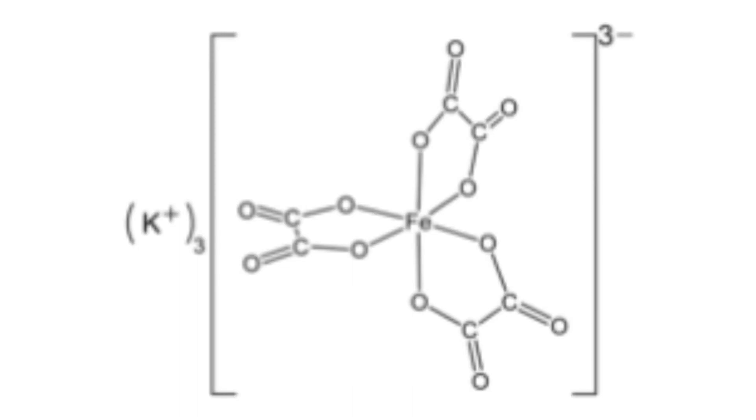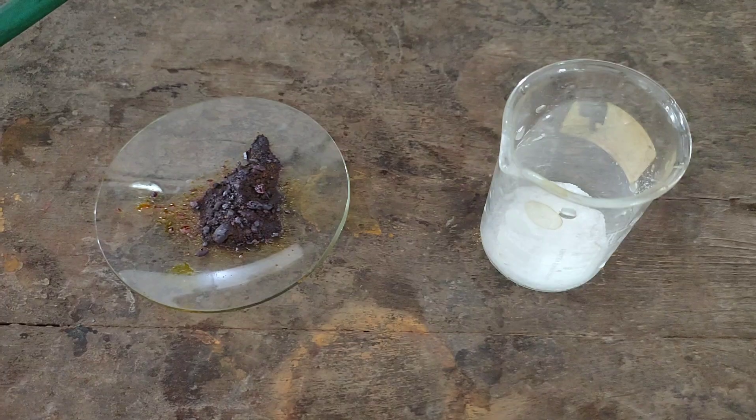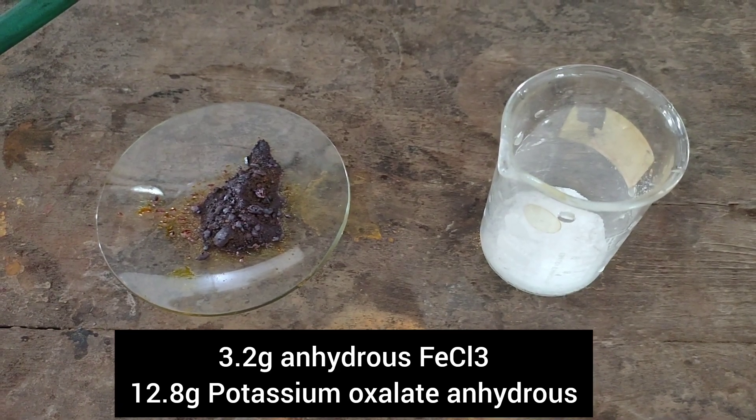In this video, I will be preparing potassium ferrioxalate, or potassium trioxalato ferriate 3 trihydrate complex. To start things off, we need 3.2 grams of anhydrous ferric chloride and 12.8 grams of anhydrous potassium oxalate.